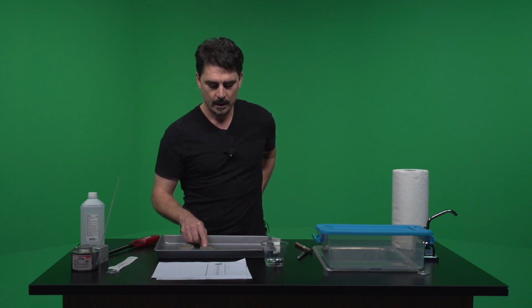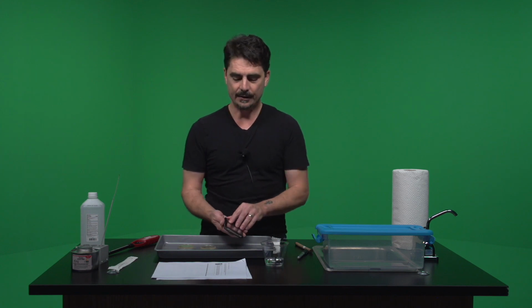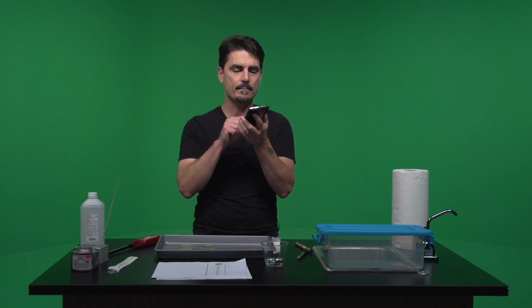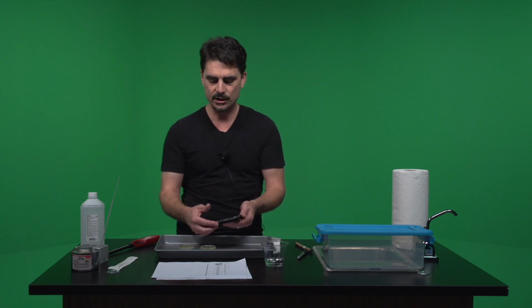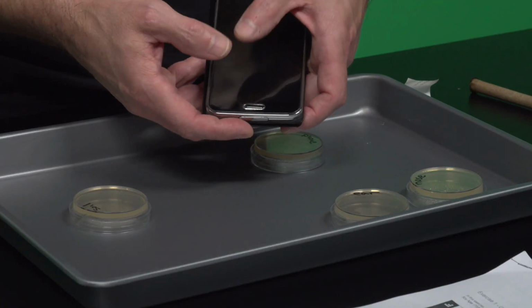And so for the phone, what I'm going to do is check out my phone here. And now think about the phone, right? Often people will talk into their phone, like if you talk into your phone like this, for example, or like this, then you may think, oh, well, I want the bacteria from my mouth. Well, there may not be much around there. What I like to do is, when I'm using my phone, how do I normally hold it? I'm doing this, right? So my thumbs are touching the surface right there. And so that's essentially what I'm going to do. I'm going to swab this particular area right here because when I'm texting, that's where my fingers are.